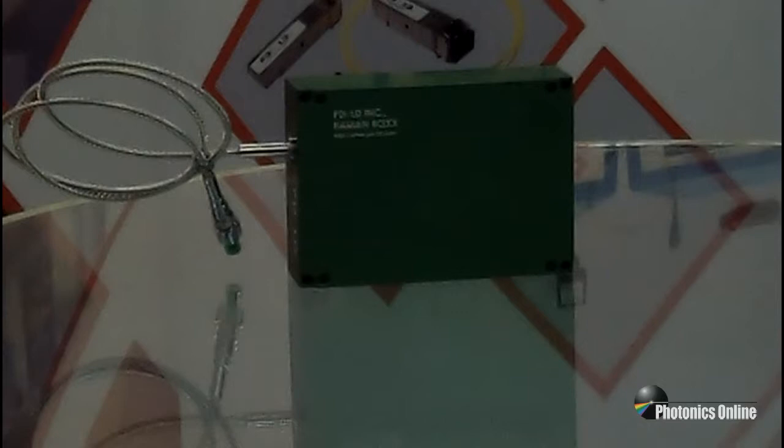The laser is available in production quantities now, affordable, economical, and stable in power, stable in wavelength.